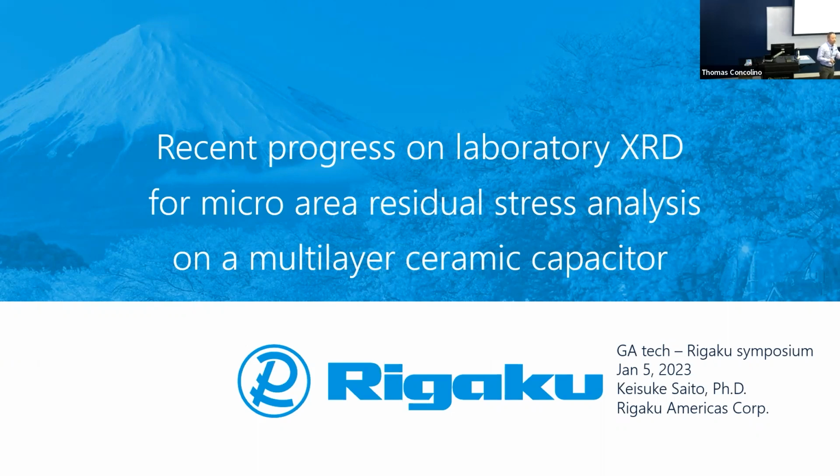So I'd like to discuss what we are working towards as micro area X-ray diffraction today in this presentation. One example is MLCC, a multilayer ceramic capacitor. We are trying to evaluate residual stress on these MLCC capacitor samples.